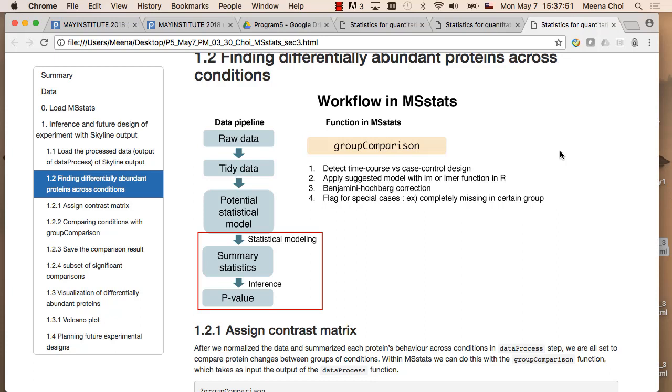maybe it can be related to some missing cases. So if you just think about our profile plot, let's say this is protein 1, here is condition 1, and here's condition 2. If we have some profile plot like this, we can summarize the value here.